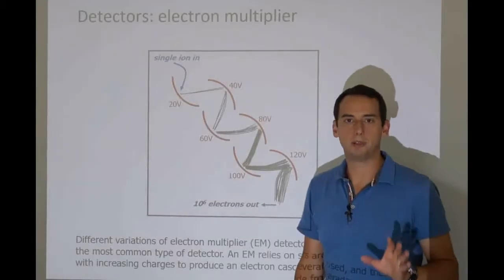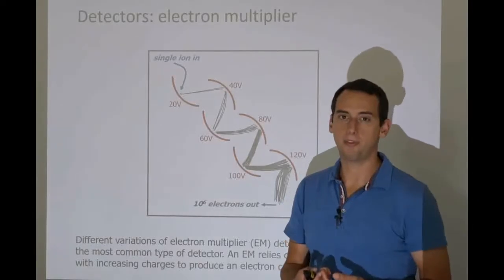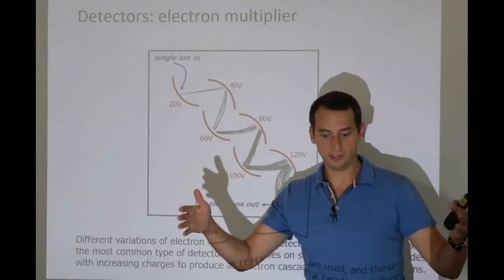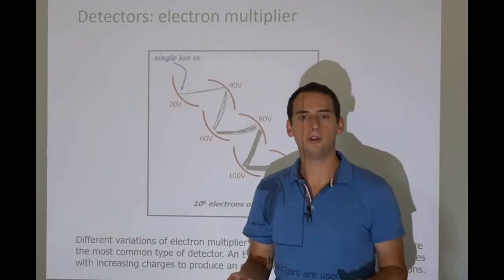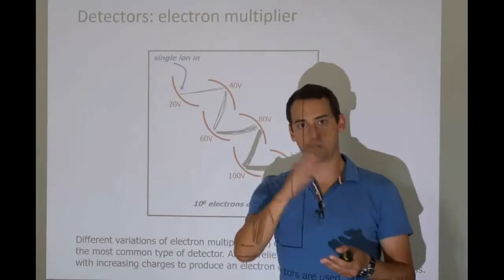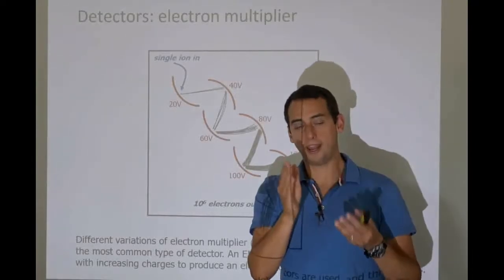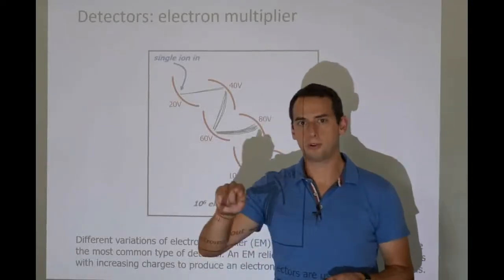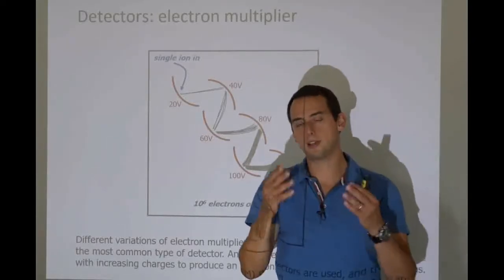This is not how detectors are built anymore, but it helps to illustrate exactly how it works. Basically, it's a very simple thing. It's an amplifier. Think about it this way. We're pushing ions through a system, a tube or a box or what have you, and these ions generate electrical currents. So if we were to have very sensitive measurement devices, we could measure the current generated by these ions passing through our detector, and this current actually gives us our signal intensity. And that's what we've been talking about. We talked about how essentially over time you see current coming through, and that's how a detector works.